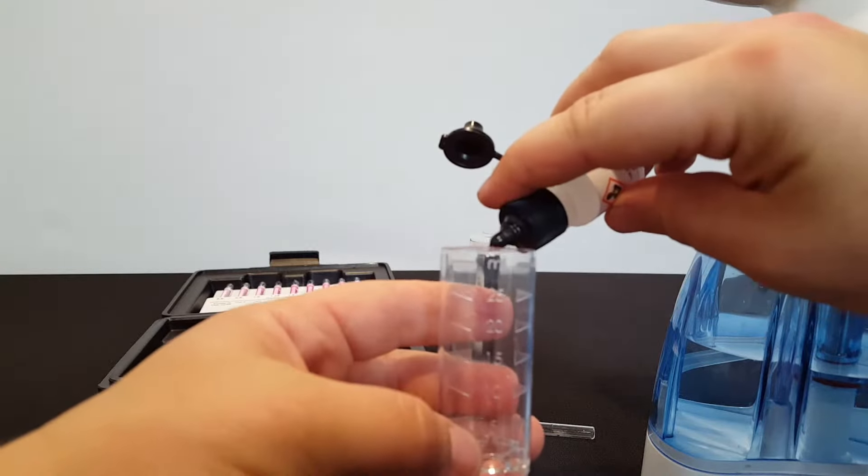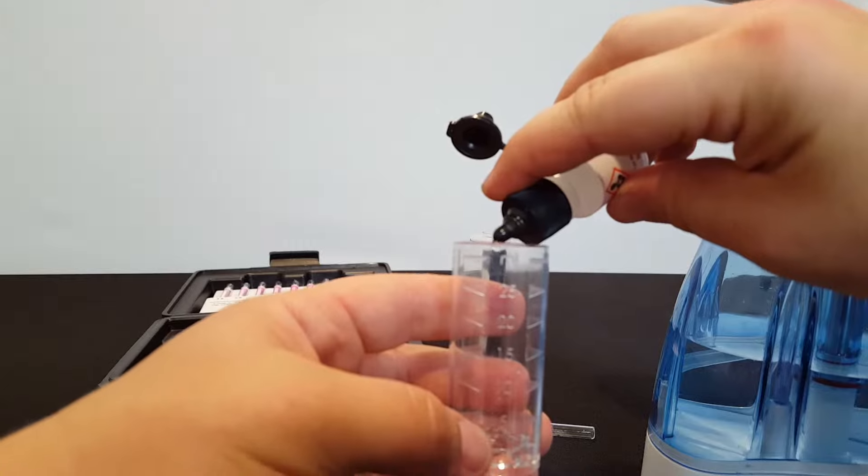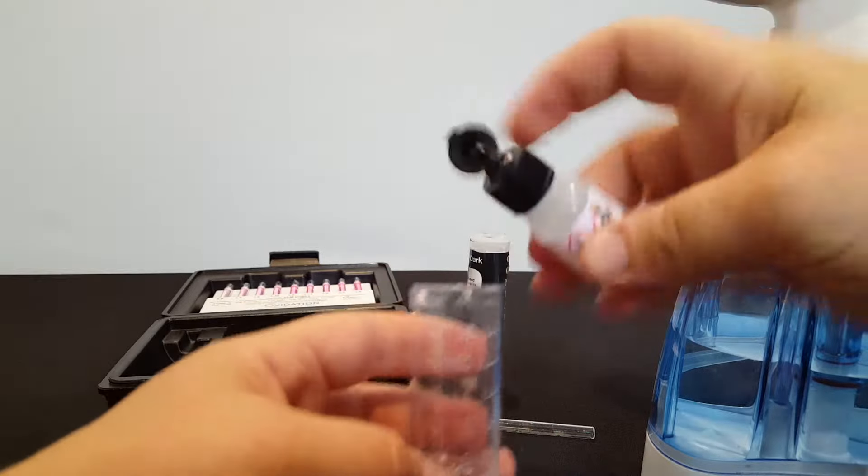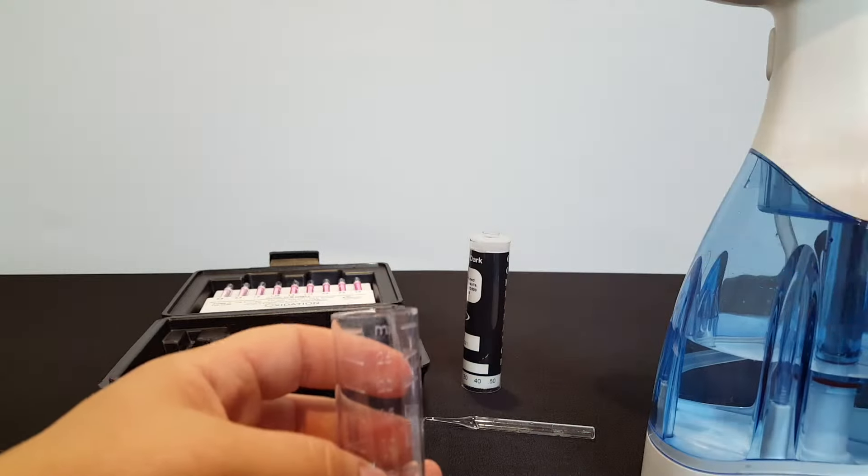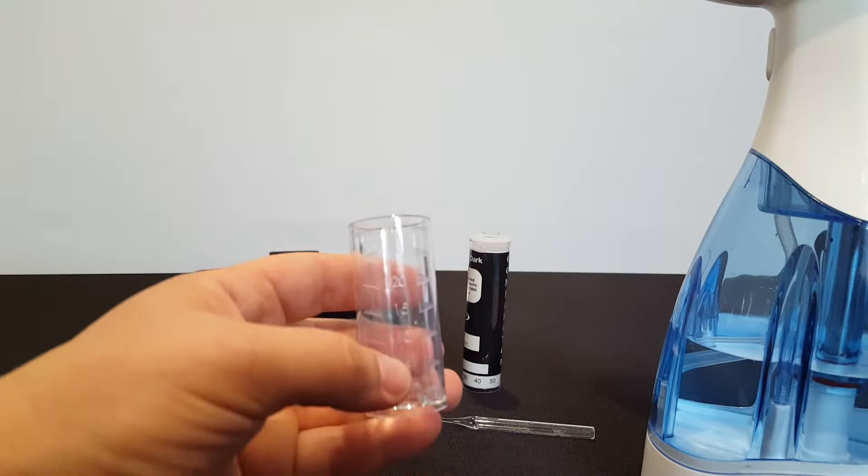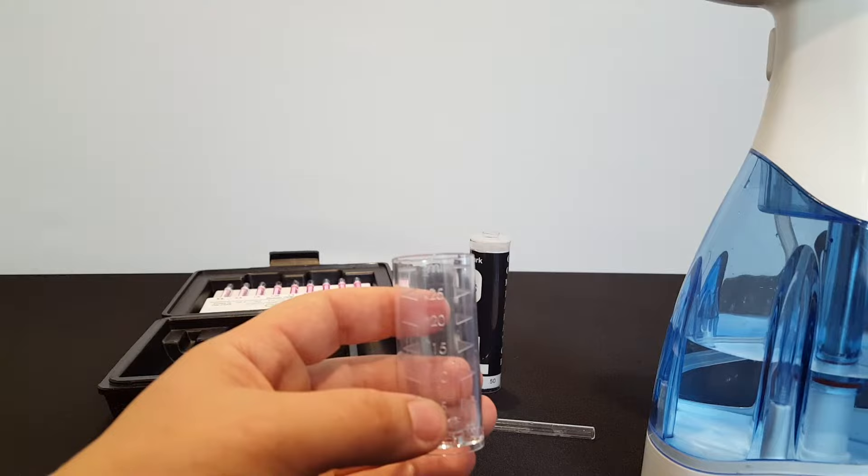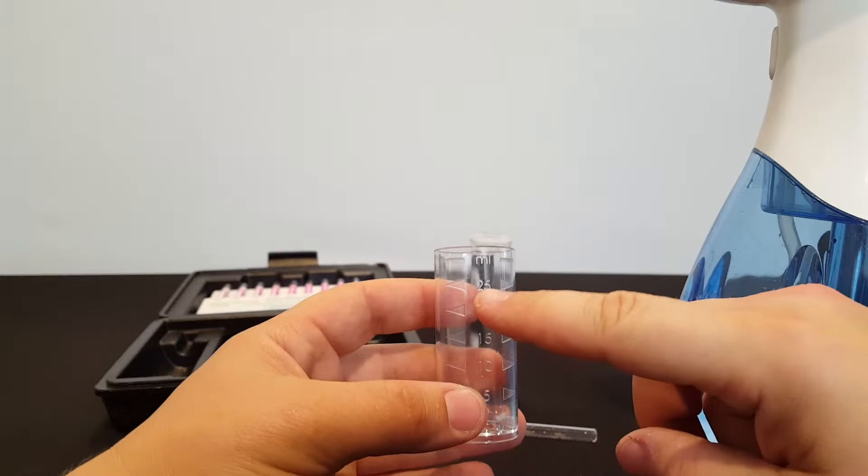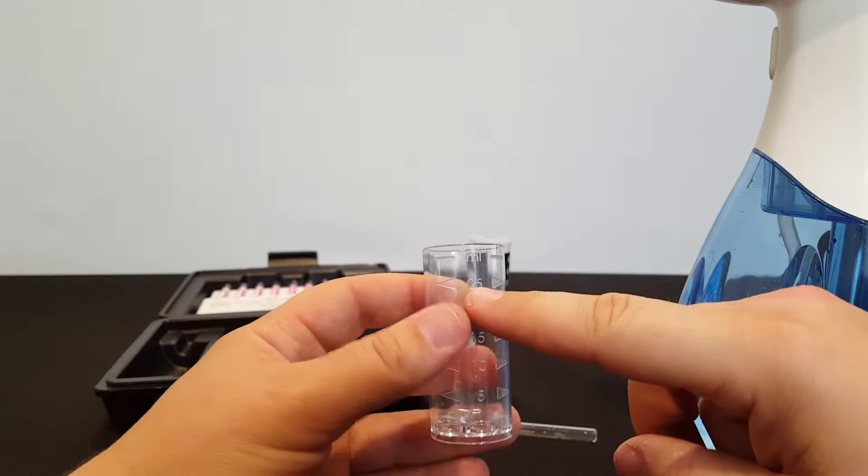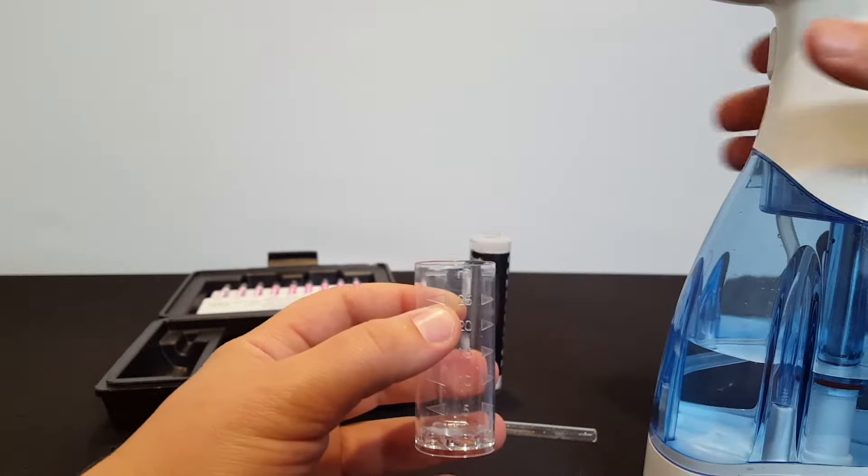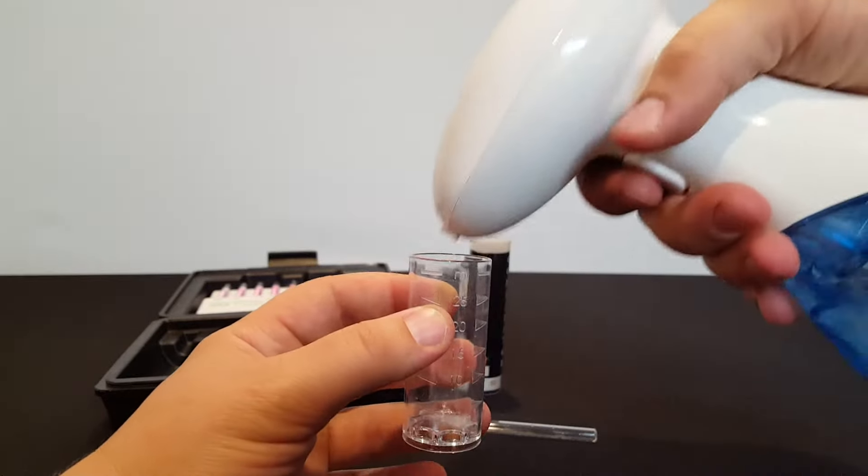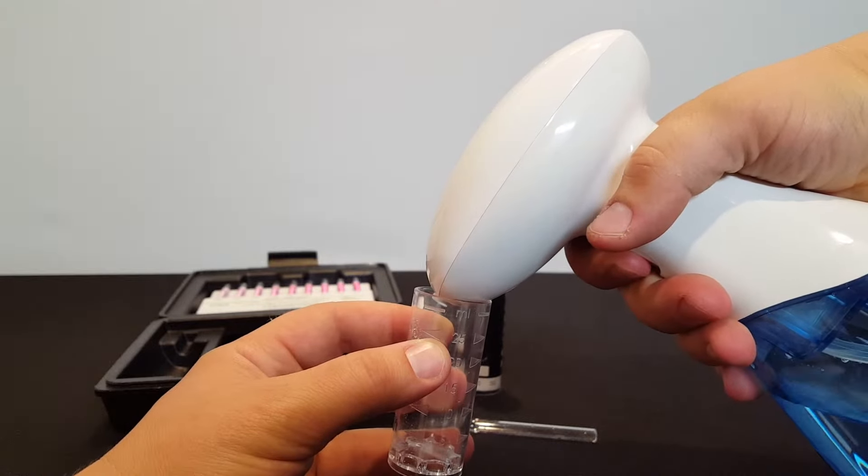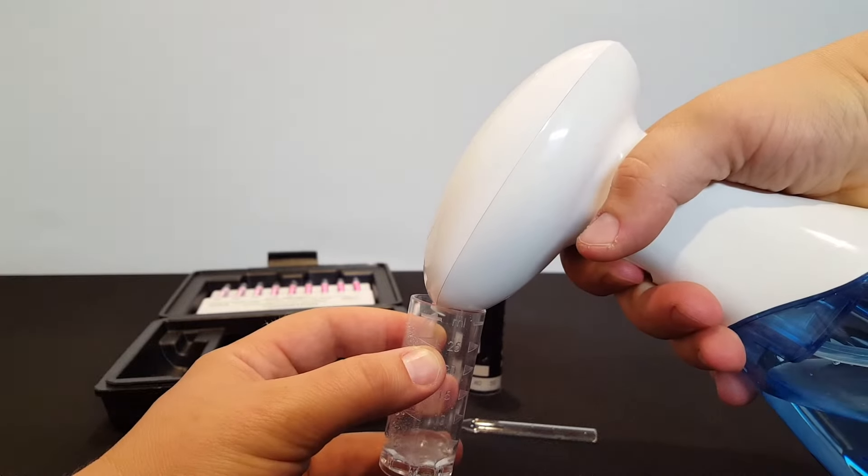We're going to start by putting five drops of activator solution into the test bottle. We want to fill it up to the 25 milliliter point with the dissolved ozone. So that's what we're doing with our spray bottle here.